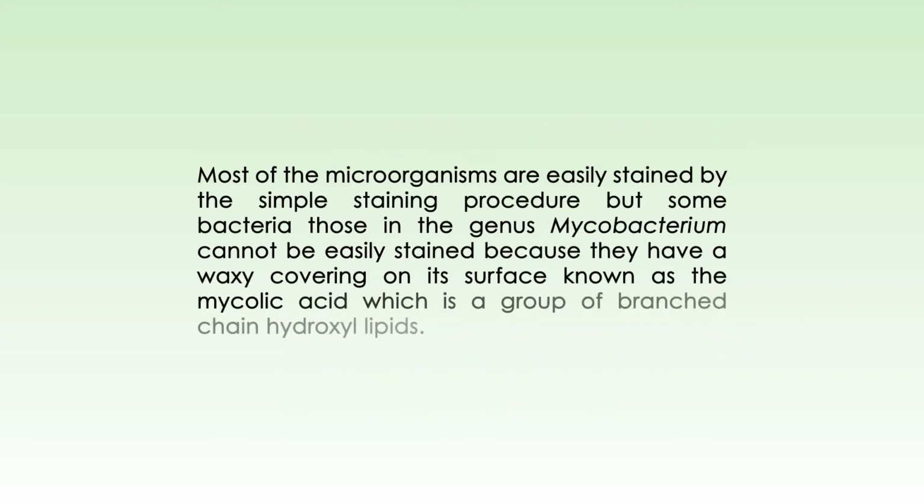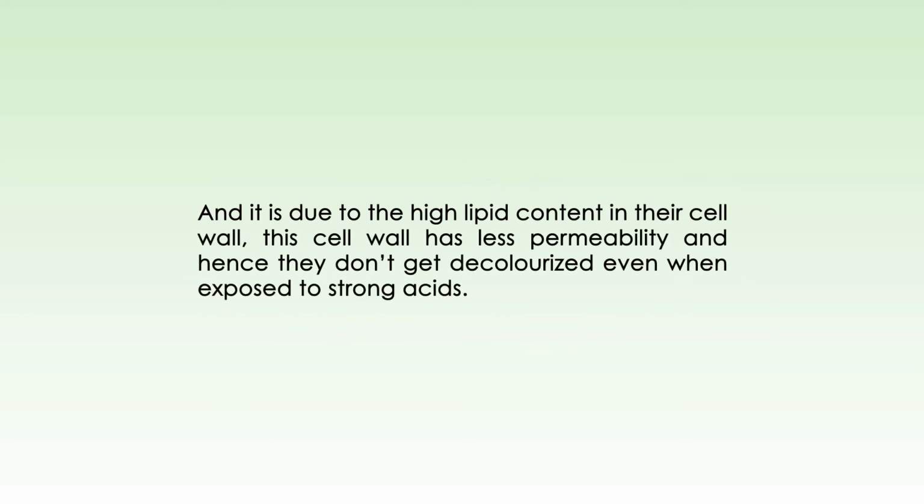So most of the microorganisms are easily stained by the simple staining procedure, but some bacteria, those in the genus Mycobacterium, cannot be easily stained because they have a waxy covering on their surface, which is known as mycolic acid, which is a group of branched chain hydroxy lipids. Due to the high lipid content, their cell wall has less permeability and hence they don't get decolorized even when exposed to strong acids.